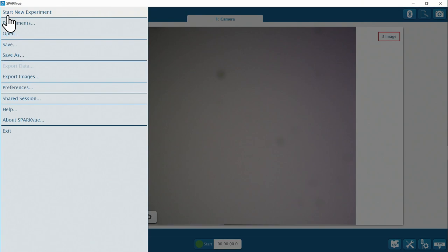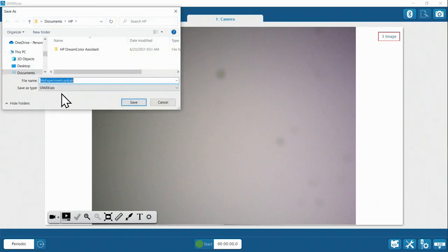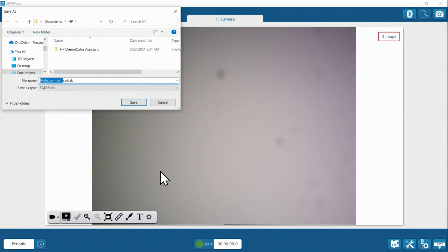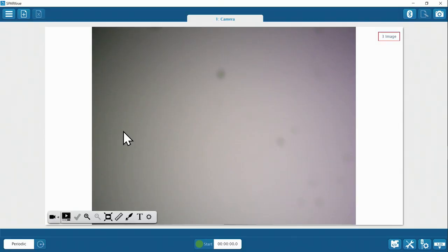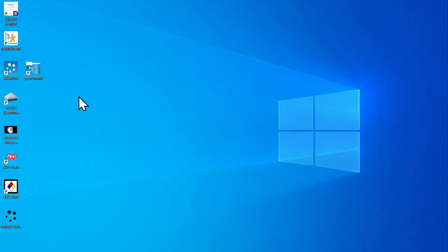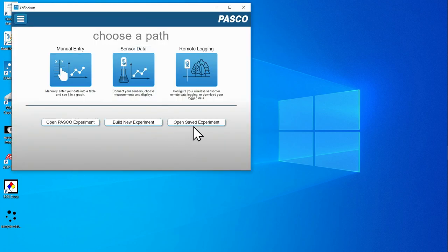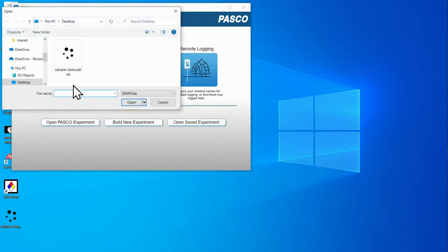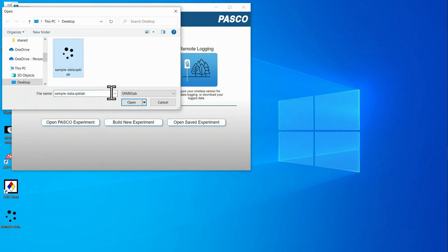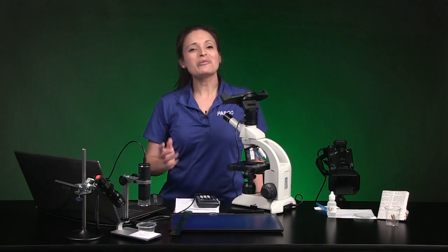Go to the main menu at the top left and choose save as. The default name is myexperiment.spklab. Select just the myexperiment part, leaving the file extension .spklab, and give it a short name. Navigate to where you want to save the file and close SparkView. To reopen, open SparkView, choose the option on the bottom right — open saved experiment — and navigate to your saved work. Now we'll move on to part two.